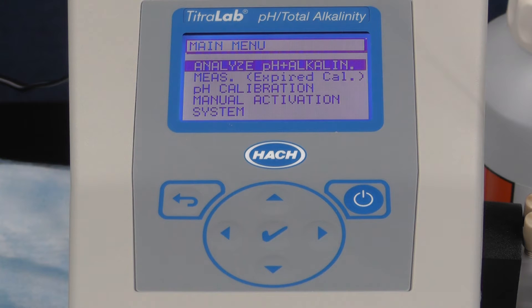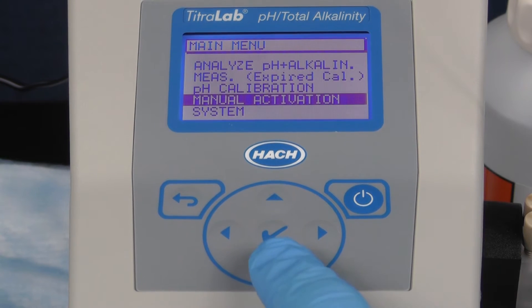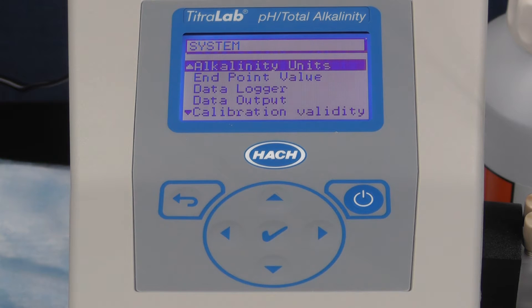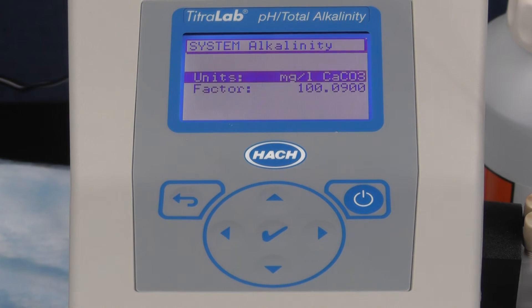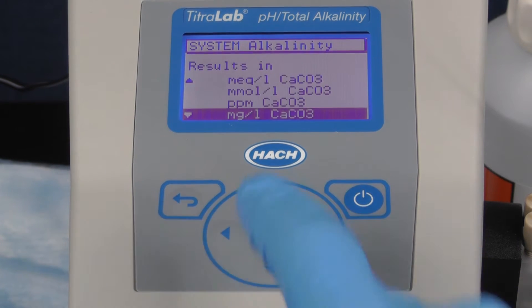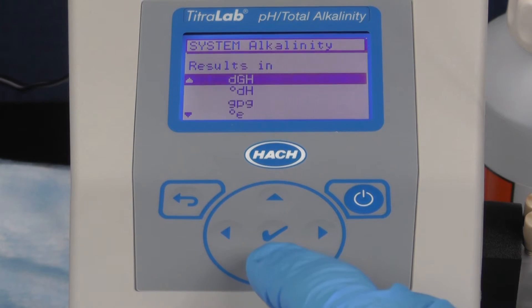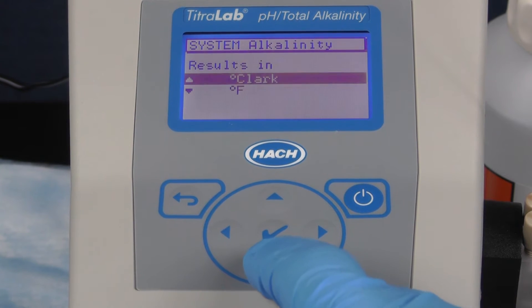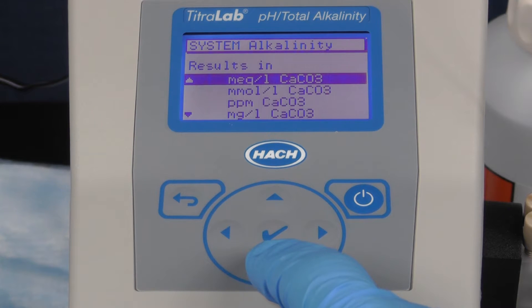To verify that you have the correct units, scroll to System, select Alkalinity Unit, and select the unit milligrams per liter CaCO3 from the list. The pH and alkalinity titrator has several options for units in calculating your results. For this demonstration, we will use milligrams per liter CaCO3 (calcium carbonate).